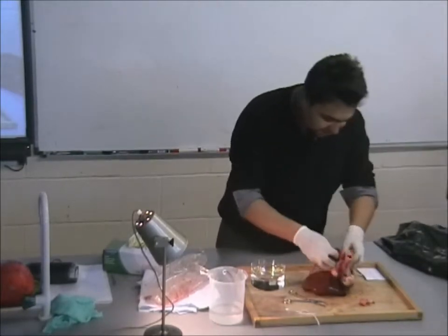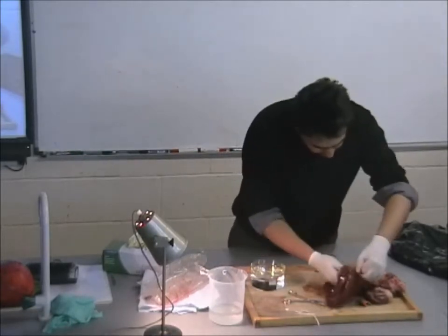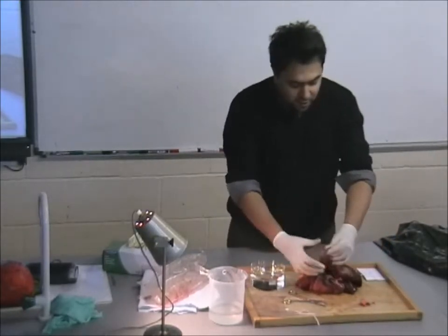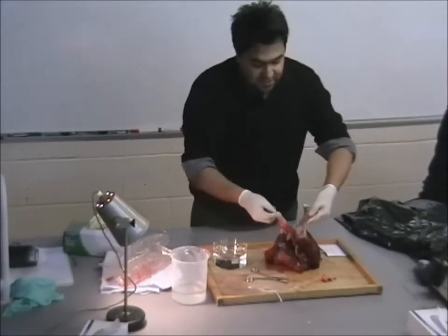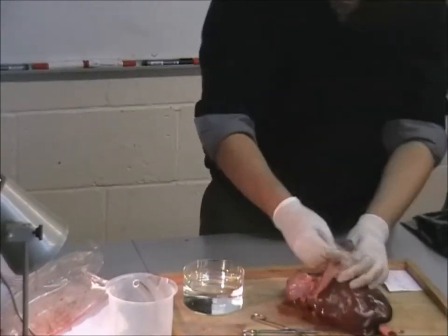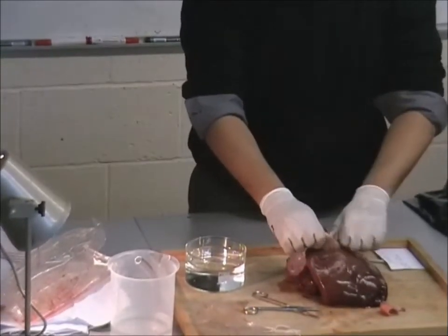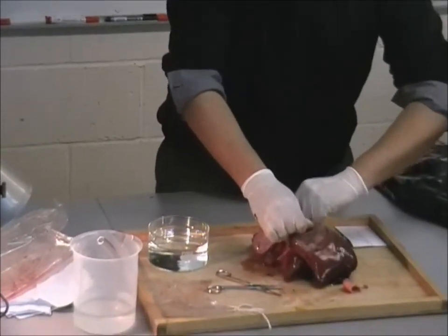Before I start dissecting the lungs, let's see if we can find the... Anyone know what this is? It is the diaphragm. Normally it's a bit bigger, but you can see it's towards the bottom of the lungs. This is the diaphragm — very thin muscle, but unbelievably strong. We're just pulling it apart — you guys can try this a bit later on. Even trying to pull it apart, it's a very, very strong muscle.